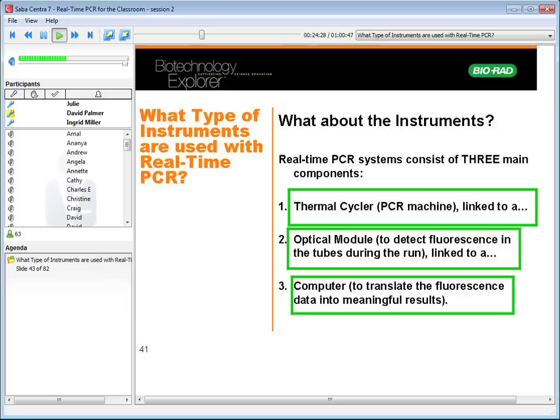And I like to bring up melt curves when I teach PCR because it gets students thinking about the structure of DNA. The GC versus AT base pairing, how GC takes a lot more energy to separate than an AT. Also how a longer DNA fragment is going to take more energy to pull apart than a shorter DNA fragment. So just teaching the concept of melt curves can lead to a whole lot of different discussions about DNA kinetics and things.